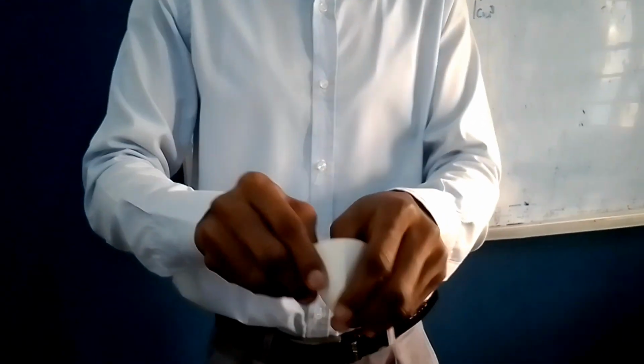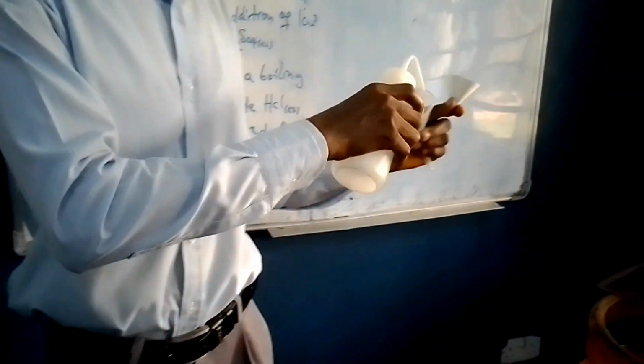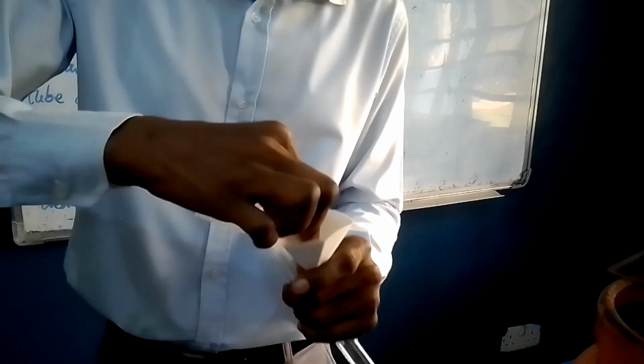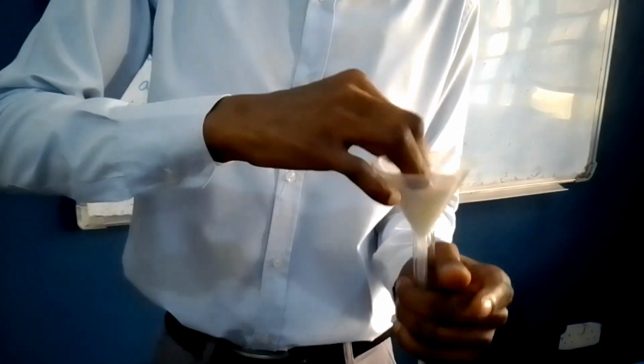Then I pick my funnel, touch some water on the funnel so that the filter paper can stay well inside the funnel, and then insert it inside the funnel.